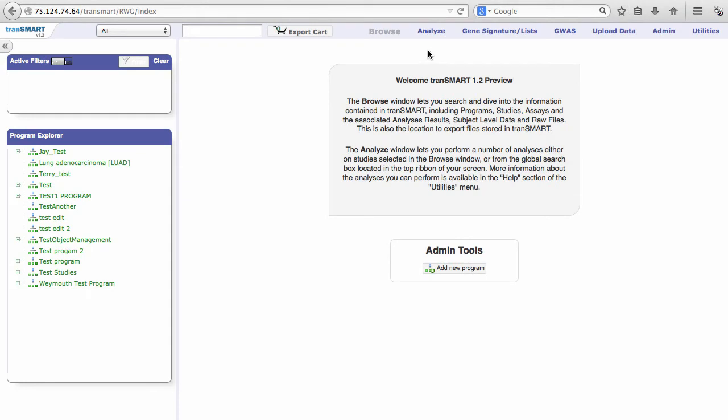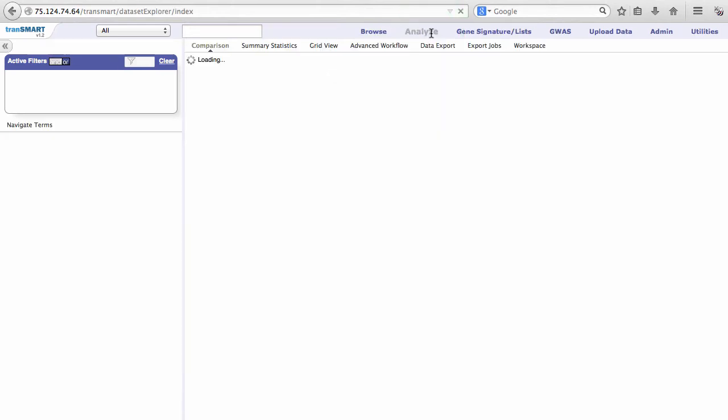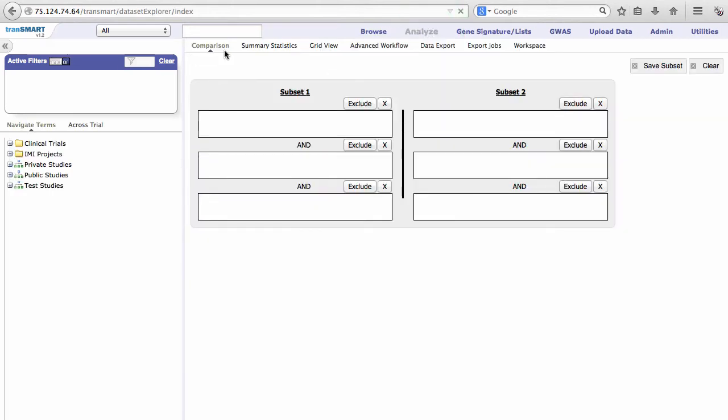Let's take a closer look at the new options within the Analyze tool. Click on the Analyze tab within the top menu. Within Analyze, make sure you are in the Comparison tab in the secondary menu.